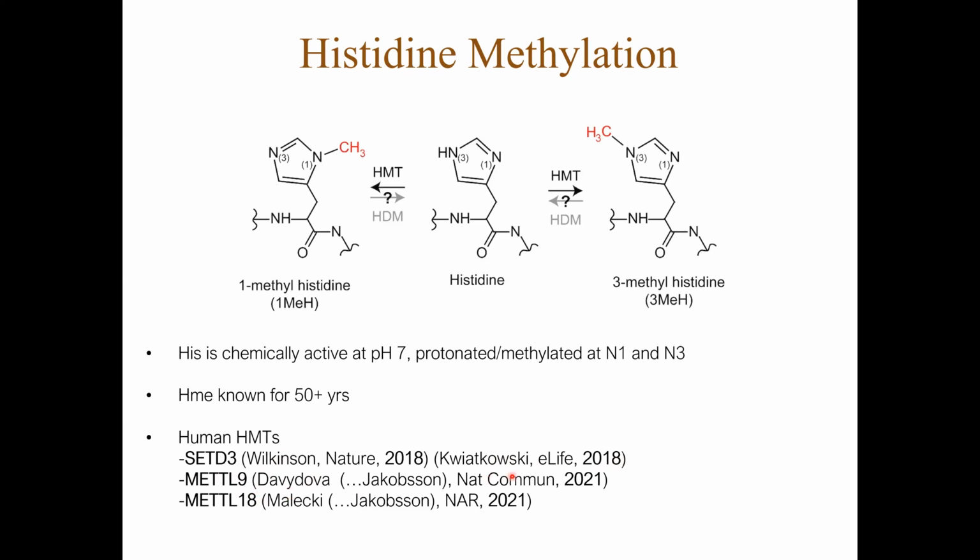These were published in Nature Communications and Nucleic Acids Research earlier this year. But aside from these four enzyme- and single-modification-centric studies, very little is known about the abundance and extent of these histidine methylations on a system and organism level.